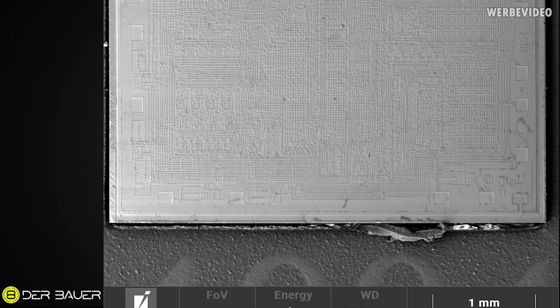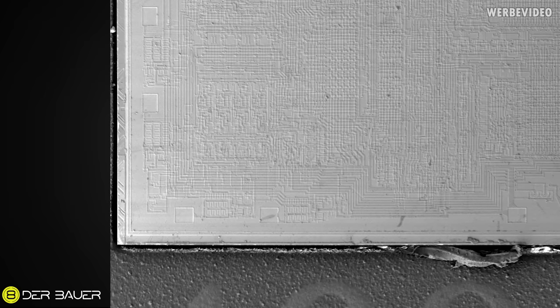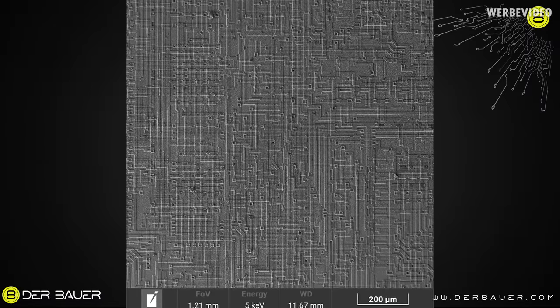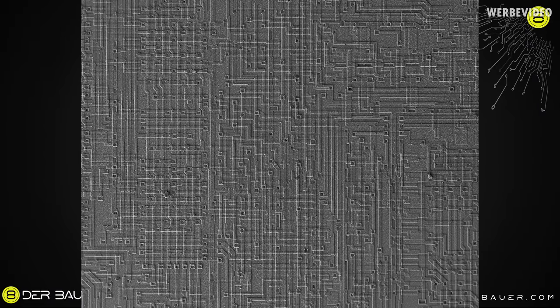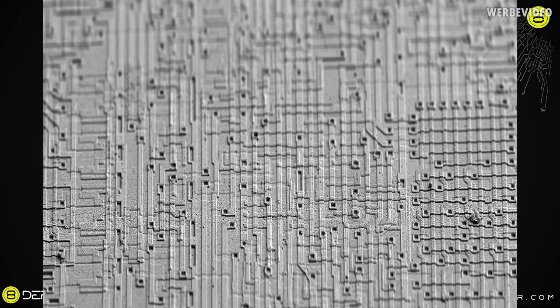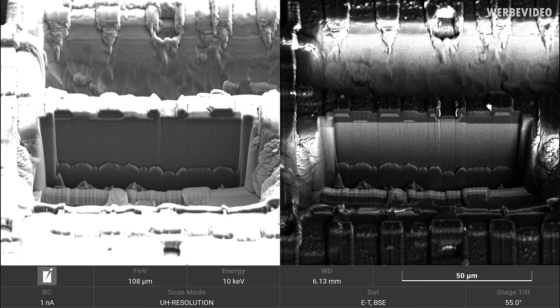You can see the contact pads, which are for making contact to the CPU, similar to an LGA or PGA socket nowadays. Next to them are tiny loops, which are part of the output buffer. About five times more magnified, we can see the traces of the CPU. At first look you might think this looks similar to a PCB, but looking closer you'll notice there are at least two layers of traces over each other, which would be different from a PCB. Those square points at the end of the traces are either connections to a different trace or forming a connection for the layer underneath, which would be the transistor.